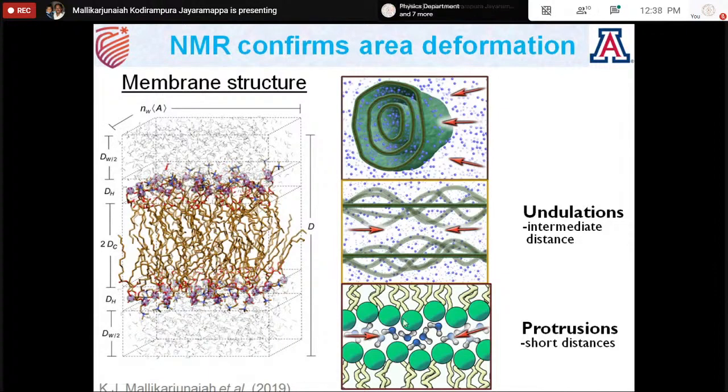This head group corresponds to the top bilayer, and this bottom head group corresponds to the bottom bilayer. And how well are these two packed? This is one layer of the onion ring, and this is another layer of the onion ring we are considering. How well can these head groups protrude within the close assembly of another set of head groups?